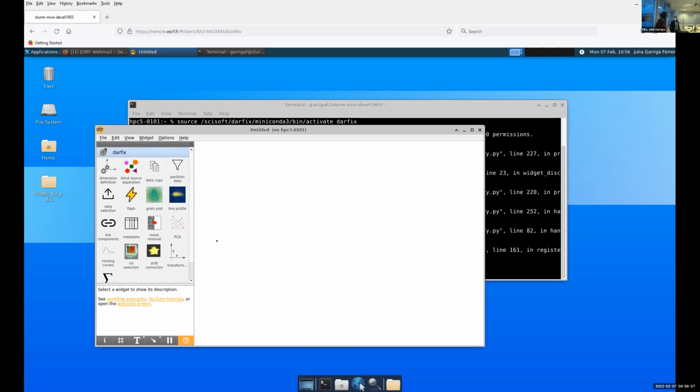You were able to correctly connect? I was able to correctly connect in the network in the ESRF. Okay. So since I'm not plugged in with an Ethernet cable, I'm out. Okay, I guess everyone else already opened orange and has the same window as we do.